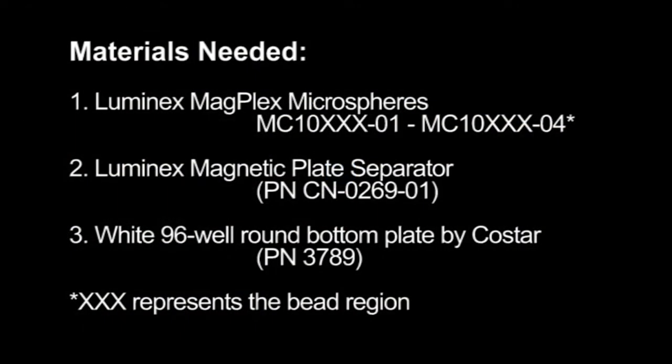To perform the following procedure, you will need MagPlex Microspheres, a Luminex Magnetic Plate Separator, and a white 96-well plate. The part number information is listed here.